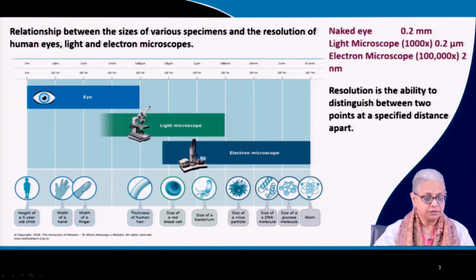So anything in this range is very easy to find, right? I can see anything up to a centimeter, half a centimeter, even less. I can go down to that level quite easily, even with poor eyesight, right? But what is the limit of the human eye? Most people cannot go beyond a fraction of a millimeter.